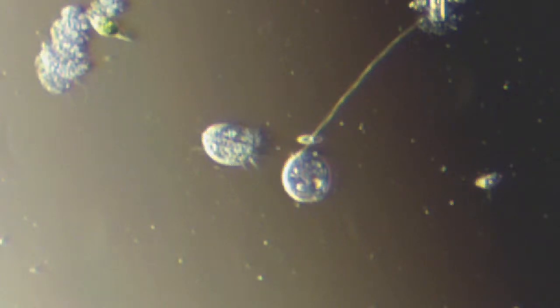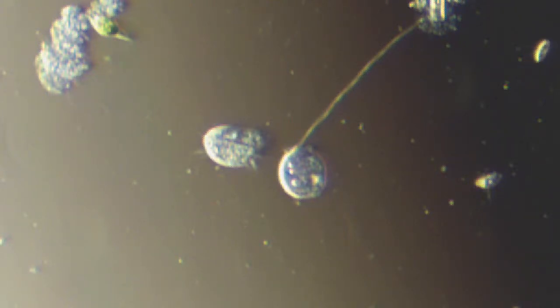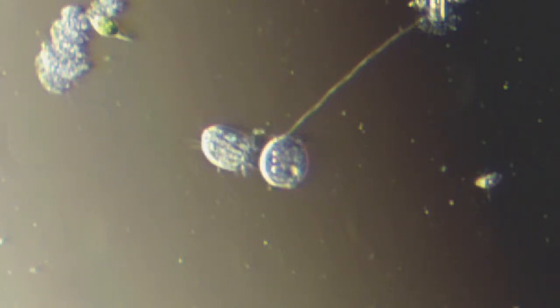But oblique lighting is great. You really get this 3D pop. The only thing better than this is the $5,000 and up. There's a little particle flying by. See the vortex he created? It did like a little gravitational assist going around it. There's a microscope technology called differential interference contrast, DIC for short, and they start at like $5,000. I'd love to get one of those because it makes this look like crap. As cool as this looks, DIC just makes the images pop, more 3D. You also have this rotating prism to give you nice background colors artificially, but aesthetically pleasing. I've done it on previous streams with color filters on my filter holder. It's called Rheinberg illumination, where you change the background color.